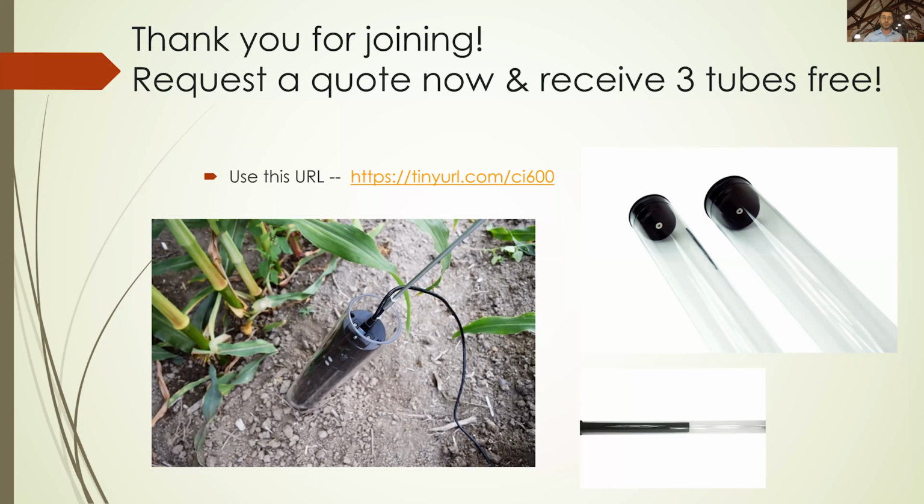So I would say keep that white calibration tube with you. To calibrate is really easy. You just stick it in, make sure it's in the home position, and press go. Also, if you're going to change the resolution, say you want to do the initial soil scan of the topsoil, you want 100 DPI because you just want an idea of where the roots are. But the lower you go, that's where you're going to want to see your mycorrhizae, your fine root hairs, your parasites. At that level, you want to get more to the 600 and the 1200. To do that, you would scan at 100, pull it out, do the calibration at 1200, and then put it back in. Thankfully, because you can measure it out, you'll know where those scans overlap, and you'll be able to tie them all in very quickly using RootSnap.